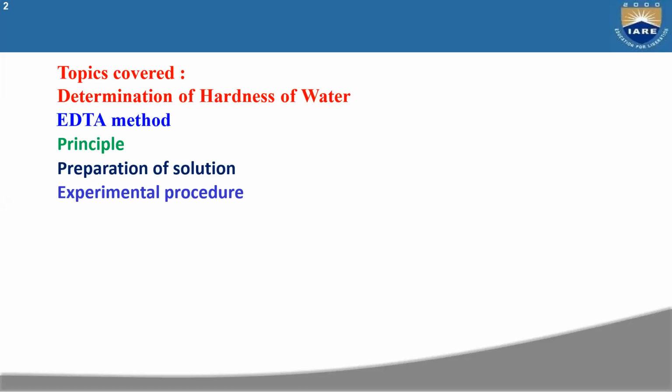Learning objectives: you will be able to explain the principle of estimation of hardness by the EDTA method, describe the procedure of this method, and perform the experiment.